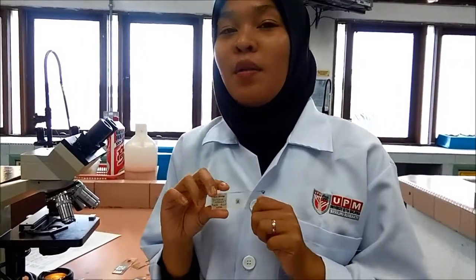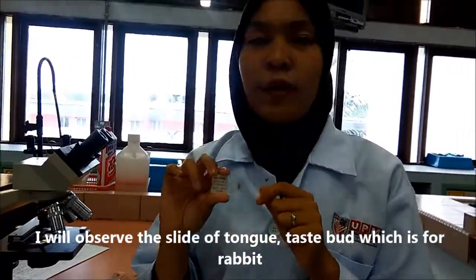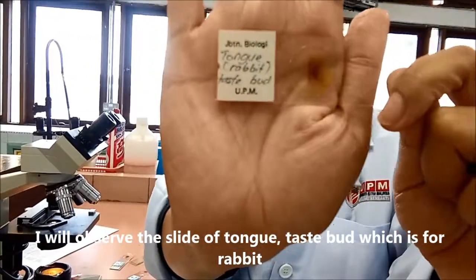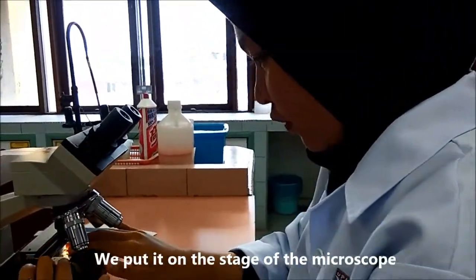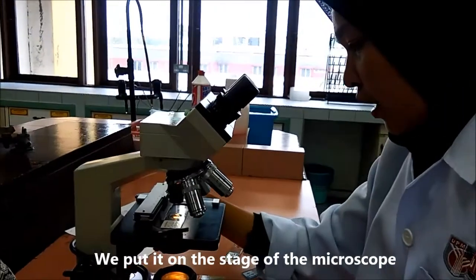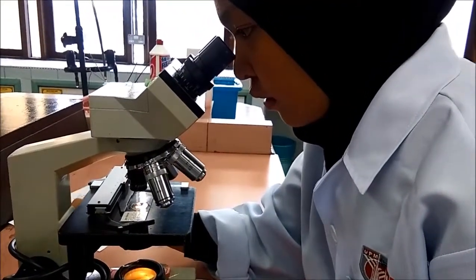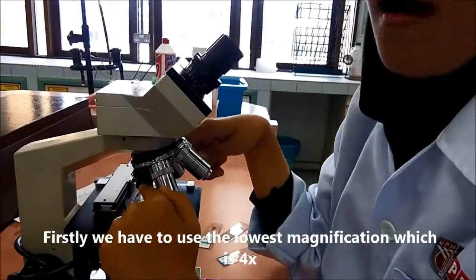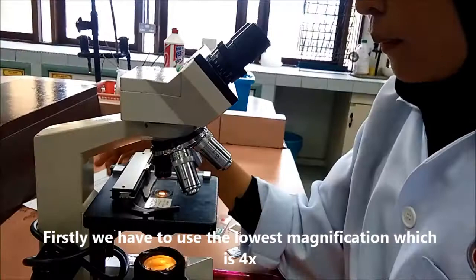Okay, now I will observe the slide of tongue. Firstly we put it on the stage of the microscope, and we adjust the stage. And firstly we have to use the lowest magnification first, which is 4 times.